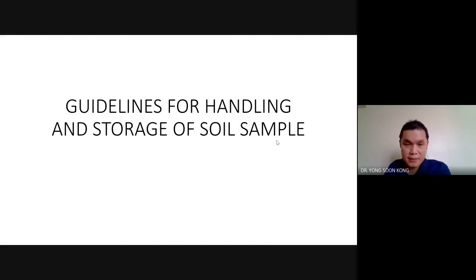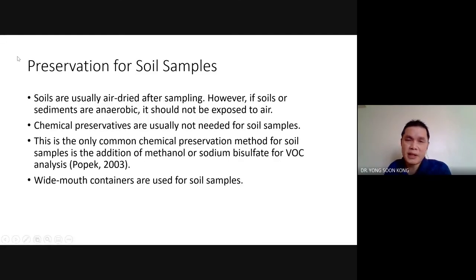So the first thing we need to know is preservation, because this is something you should have in mind before you even go to the sampling site. How do you preserve your soil sample? The key is you have to ask yourself, what are you dealing with? Are you dealing with organic compounds or are you dealing with heavy metals? Because preserving these two is very different.